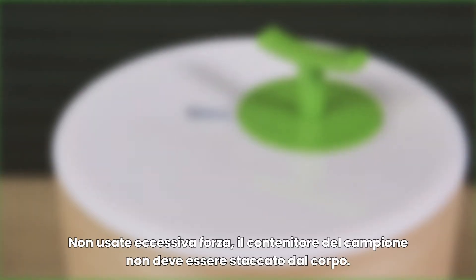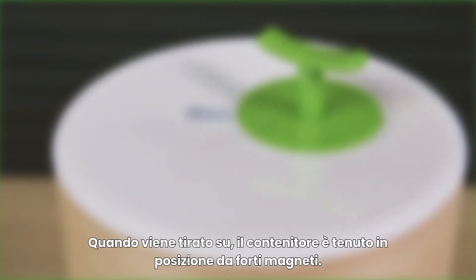Do not try opening the sample container. Do not use excessive force. The sample container is not meant to be detached from the body. When pulled up, the container is held in place by strong magnets.